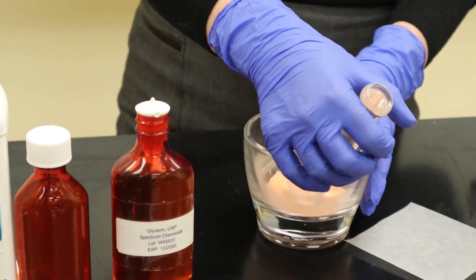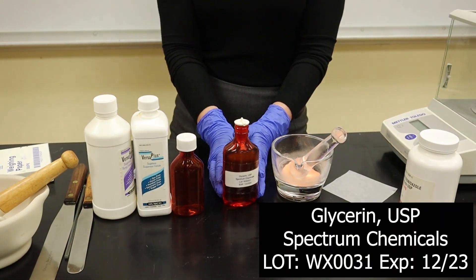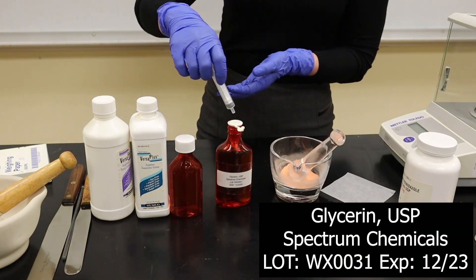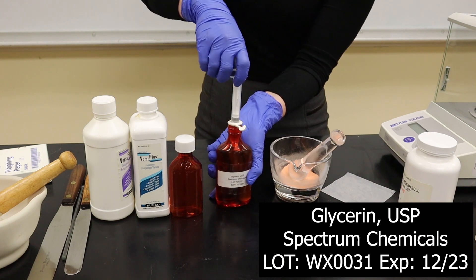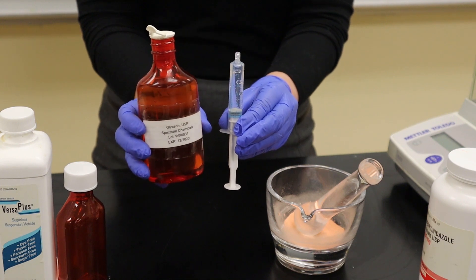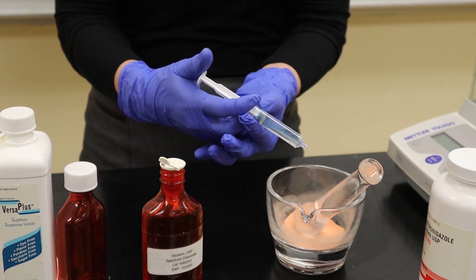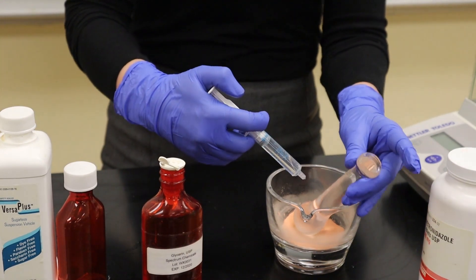Now that I have this all triturated into a nice fine powder I'm going to use glycerin as my wetting agent. I've drawn up 5 ml of glycerin using a 5 ml syringe and I'm going to add about a mil to a mil and a half at a time until I get the desired consistency that I want.